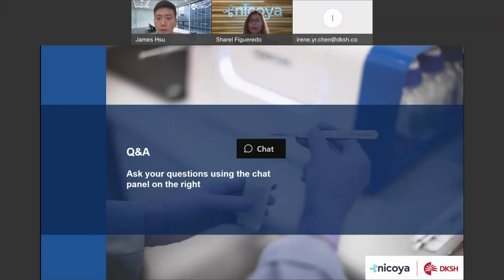Okay, thank you. And another question. Yeah, the question is, how about the analysis of nanoparticles such as exosome? We only can determine the Ka and Kd of the ligand present on nanoparticle. And can we characterize the nanoparticle in terms of size and quantity as well?